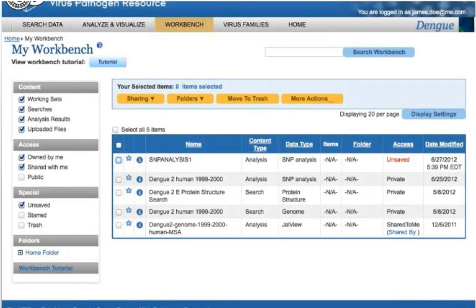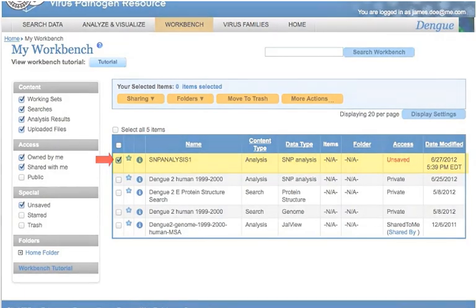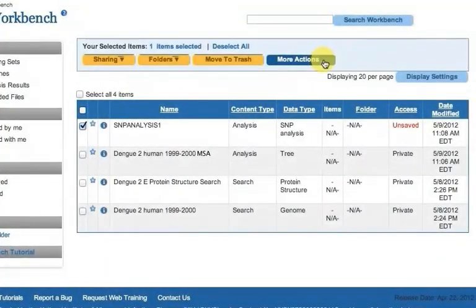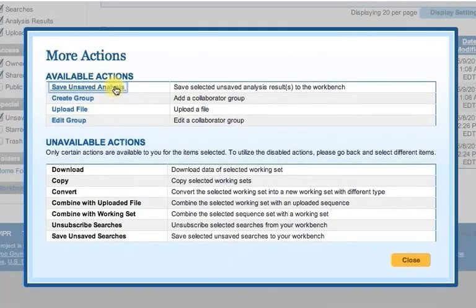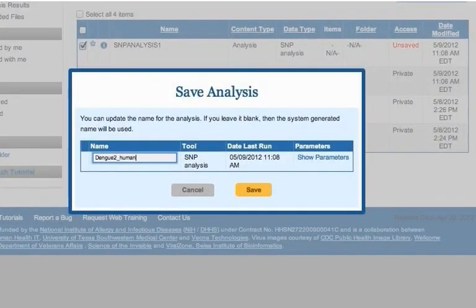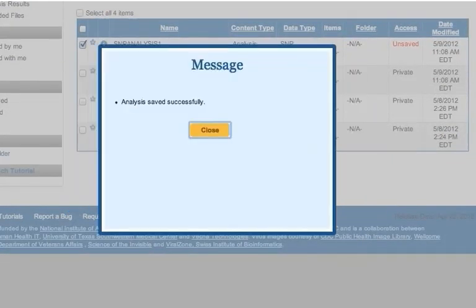To save the results of an analysis you previously ran during the same session, navigate to the workbench area and select the checkbox next to the analysis you would like to save. Then click the More Actions button and click Save Unsaved Analysis. Enter a name and click Save.